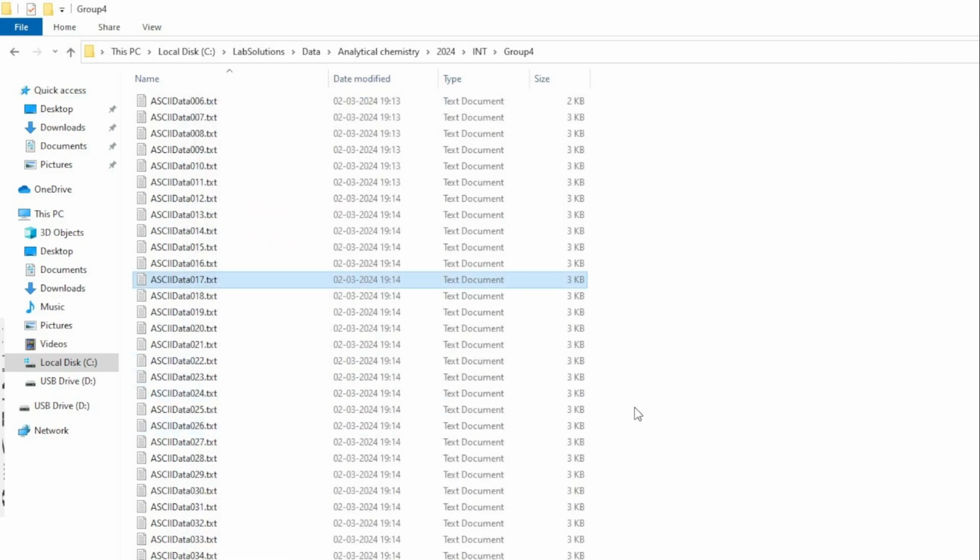And from there, you have to either manually copy them into Excel, or you have to figure out a way to actually put together all of the data. So something like Python could be used to chew through all of the data you have and create the outputs that you're interested in.